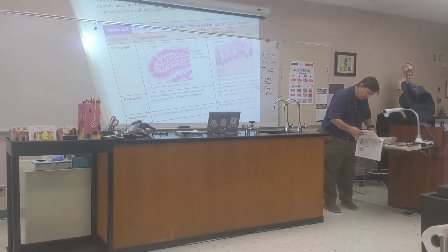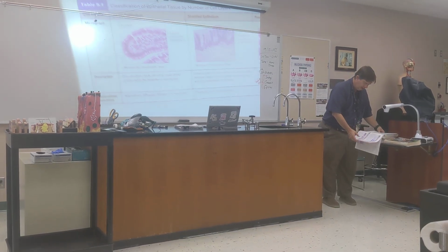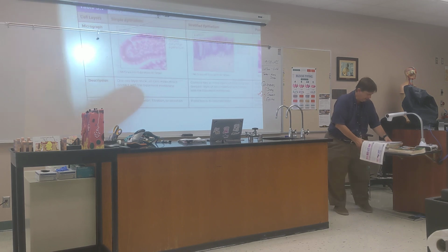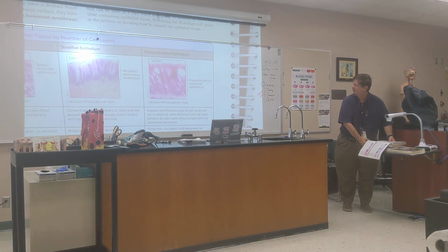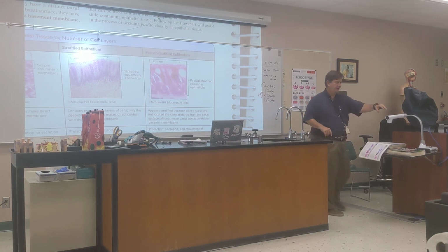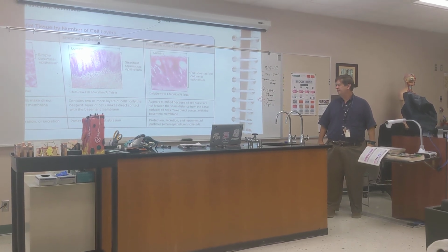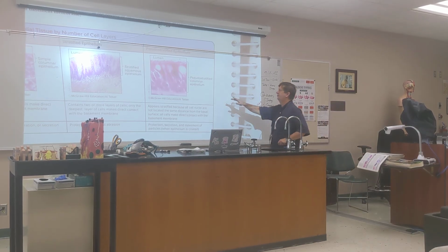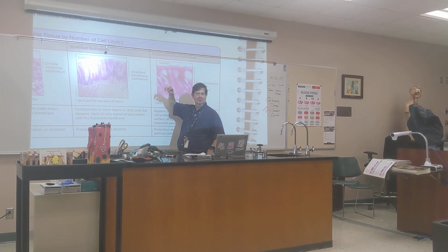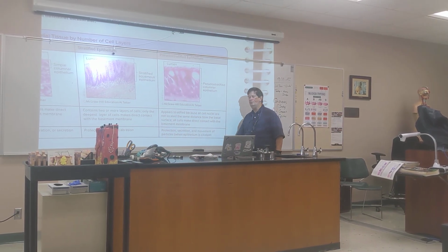The one that you just drew, wasn't that page 95? That was pseudostratified columnar. What was the function of that one? It's protective because it moves the mucus. Okay. Here, I'll take your lab book and put it right there. Pseudostratified columnar epithelium: protection, secretion, and movement of particles when the epithelium is ciliated, as it is with all the cilia sticking up in the lining of your trachea. Good? So location, trachea; function, protection, secretion, movement of particles.